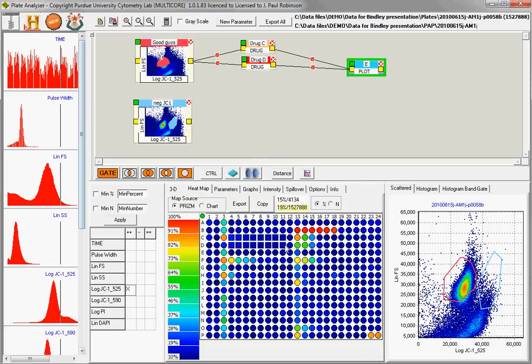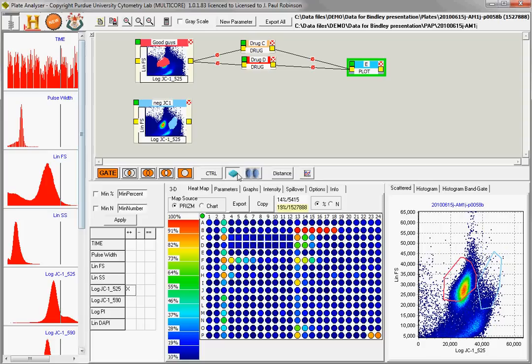If you have duplicates, you would do that, and that would represent those drugs. And when you join this to here, then basically what you have now is a situation where this drug here is now duplicates. Of course, it isn't, and so it's not going to look quite right.